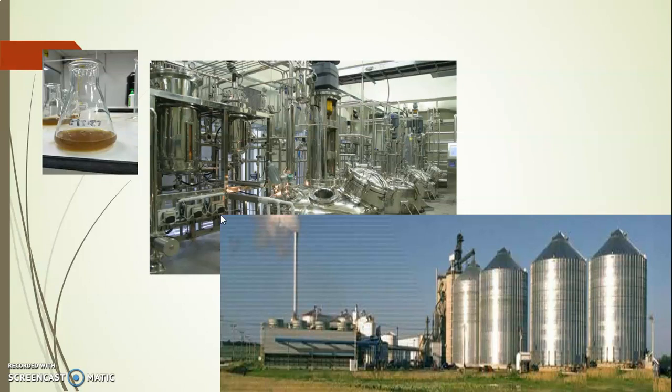Therefore, based on its definition, if a biology-based reaction goes on in a shake flask, in that case the shake flask can be called a bioreactor. So you can see that the shake flask is also considered a bioreactor, besides the very huge bioreactors as can be seen in the pictures. So the size and shape of bioreactors can vary tremendously.